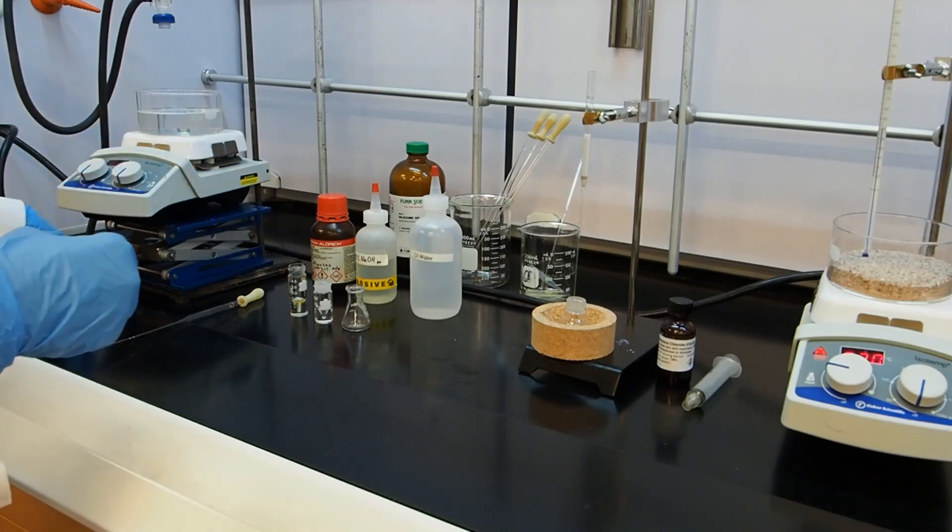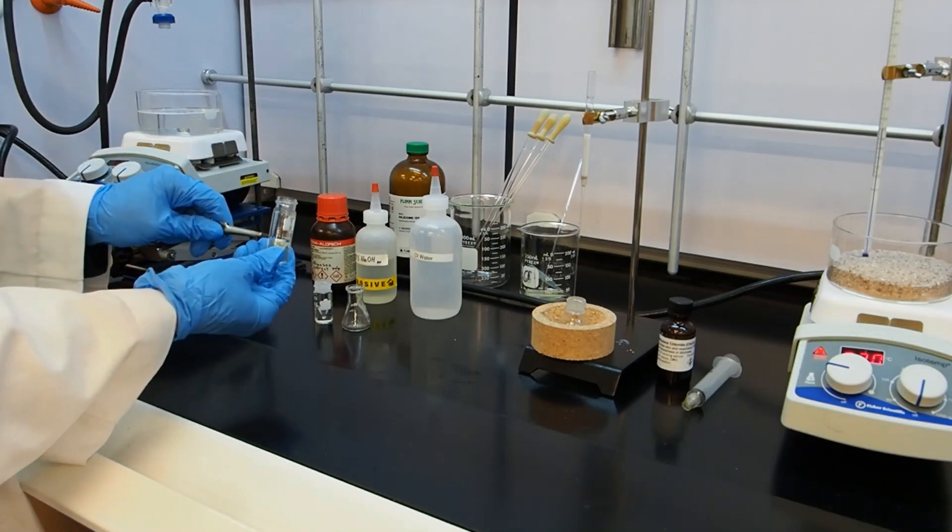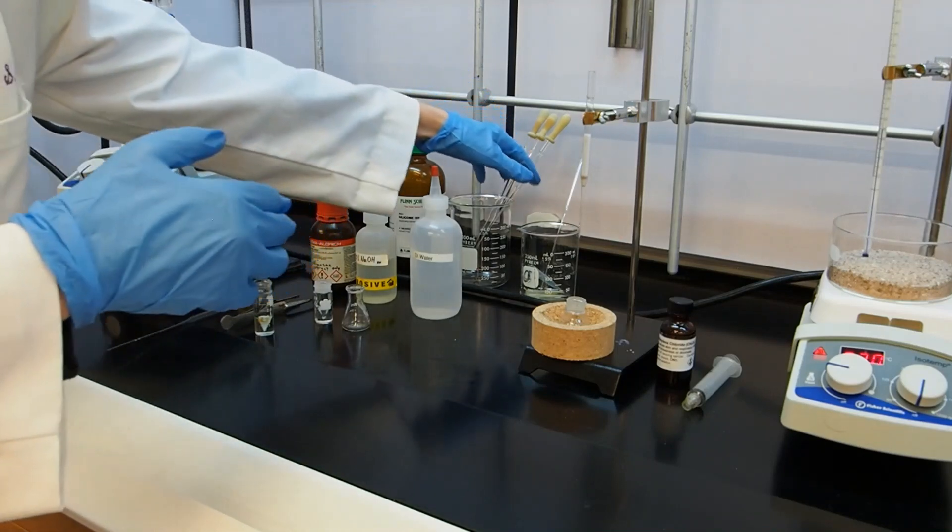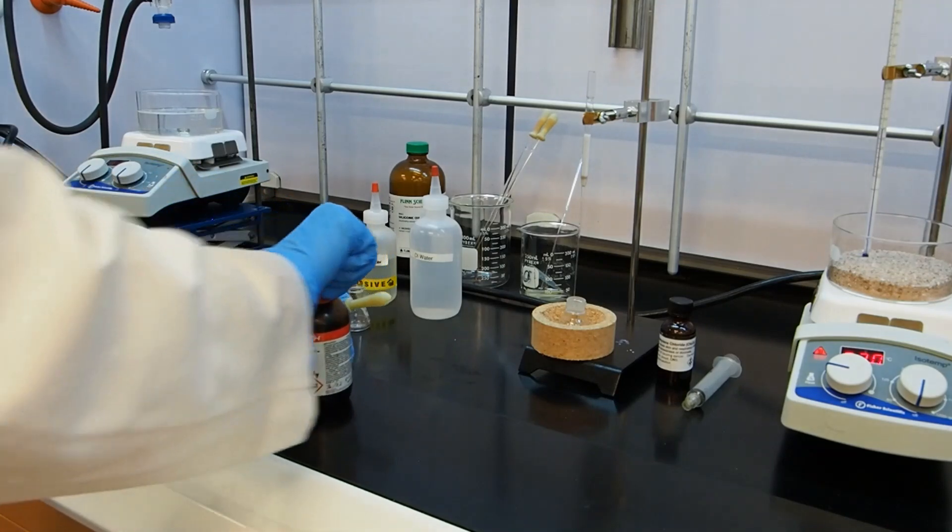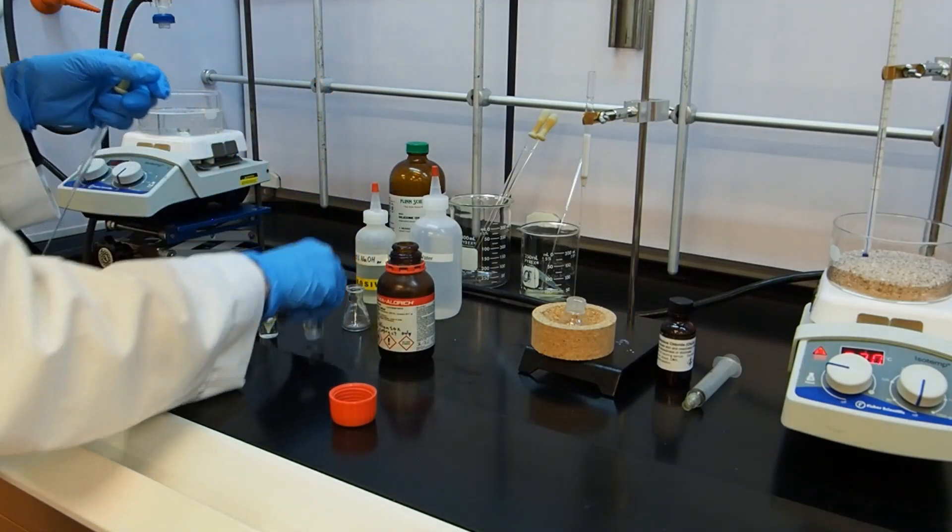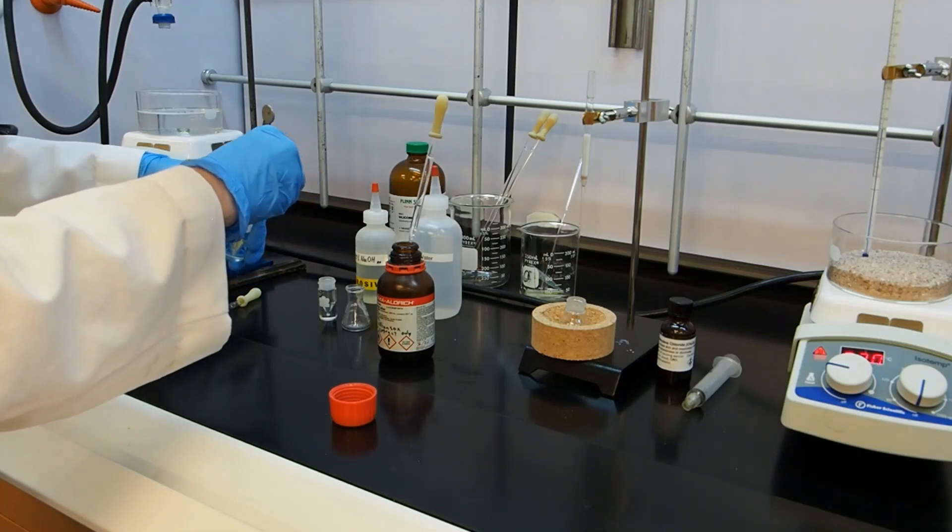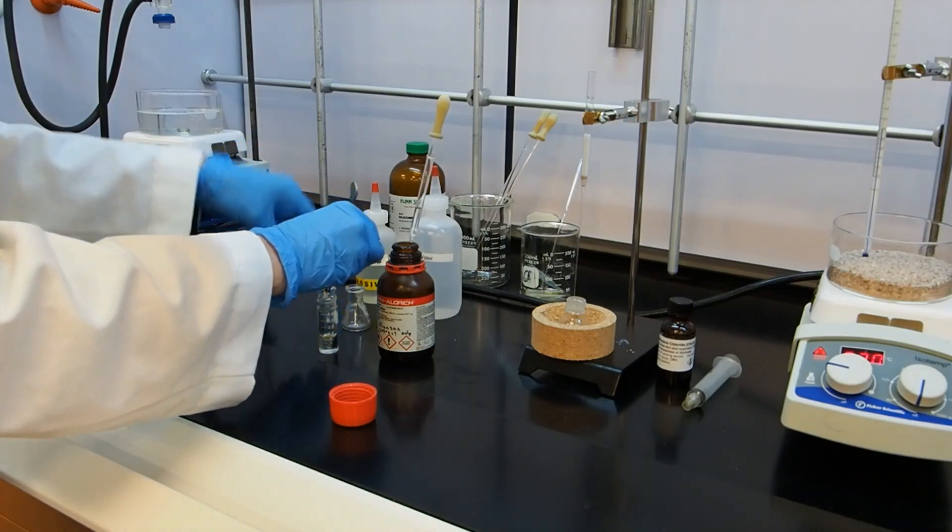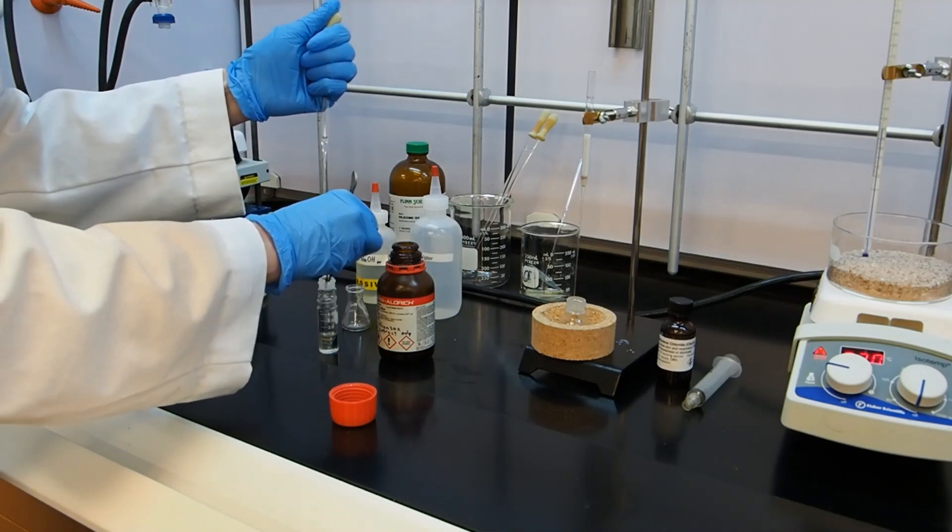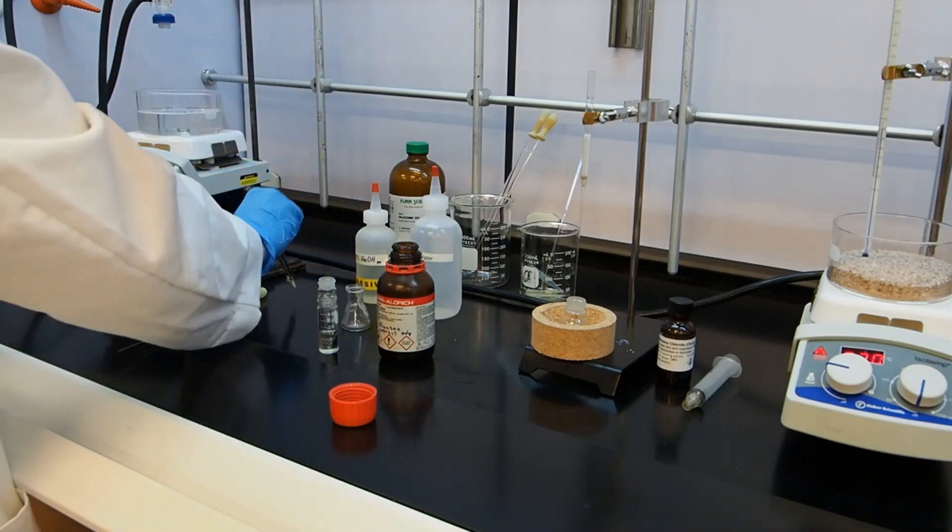So the next thing to do is we need to get this spin vane out of here, but we don't want to lose any product that might be on it. So what we're going to do is we're going to get a milliliter or so, which is approximately one squirt with these pipettes. We're going to retrieve the stir bar with the forceps, hold it over top of the reaction, and rinse it off with a milliliter of ether. That way we don't throw away any product that was stuck to our spin vane. Now I can set that aside to be washed later.